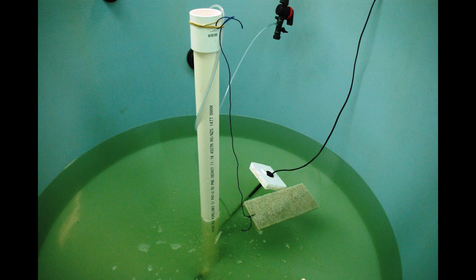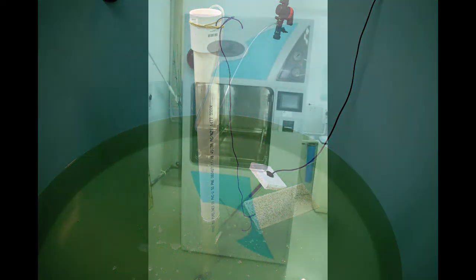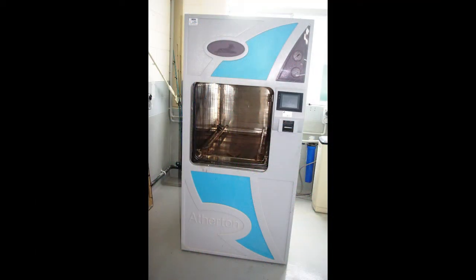Rearing of copepods in tanks is dependent on the production of the microalgae, TISO. Hygiene is critical to prevent contamination of microalgae cultures.